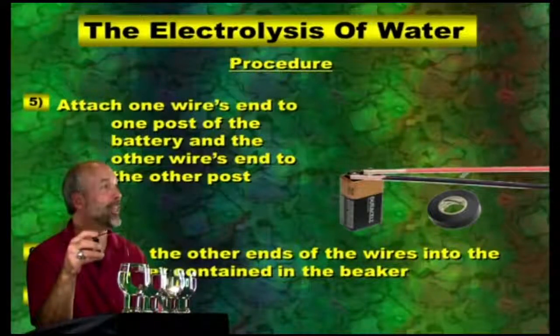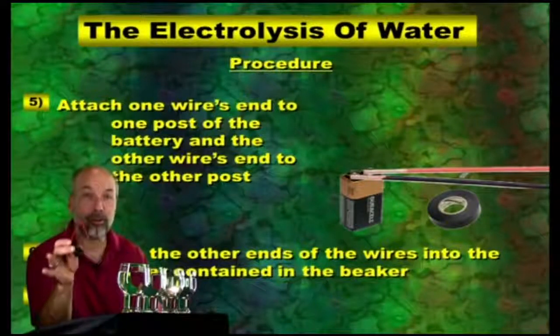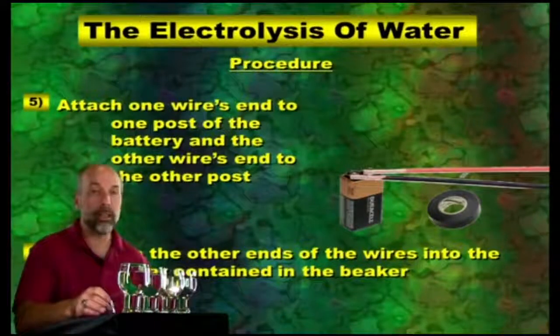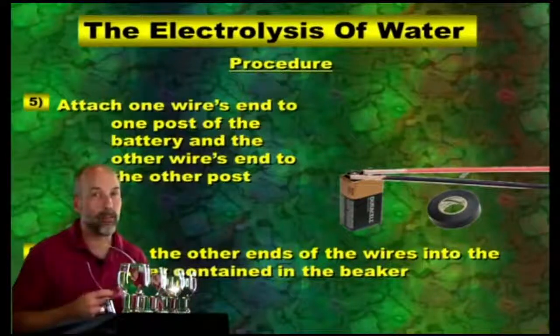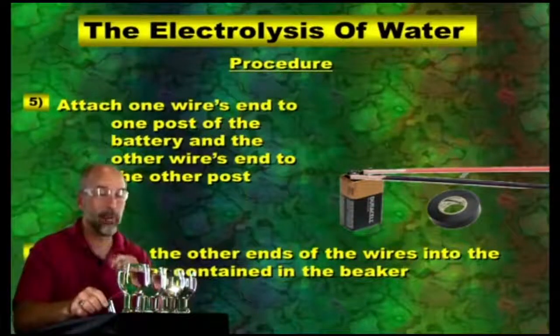We're going to immerse the other ends of the wire into the water, and then we're going to see what's happening. So here's our very first one. Seeing that we're doing a lab, we want to be careful. So pull out your safety glasses, and let's see whether or not we can see anything happen.